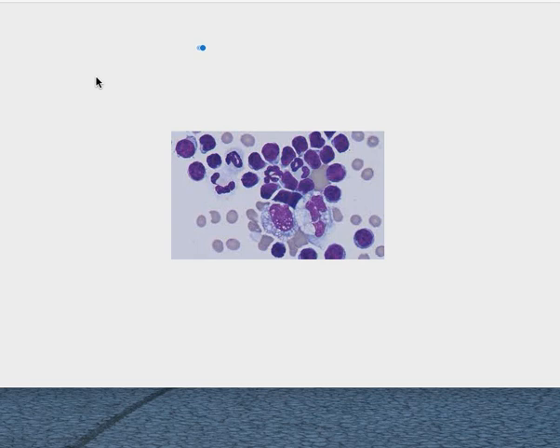Also remember that when we're talking about total proteins down in the 3s and the 2s, it's not going to stick on the slide like blood, which has a 6 or 7. So once you take your sample and you get it nicely air dried, do not use a hair dryer, or if you do, keep it very far away from the heat till it's thoroughly dry. Then you're going to stain it very, very gently so that it will stick onto the slide. And usually if it's a thin prep, you're going to stain it more like blood. If it's a thick exudate, probably going to stain it a lot longer.